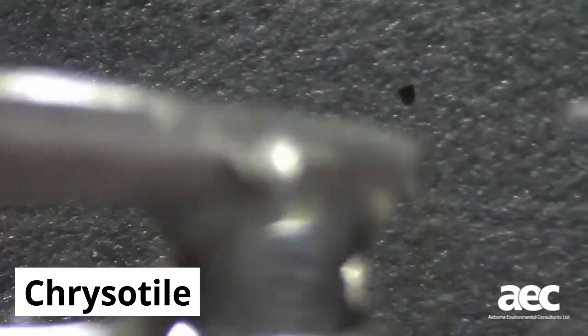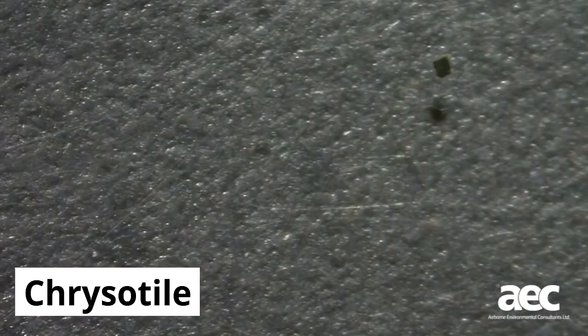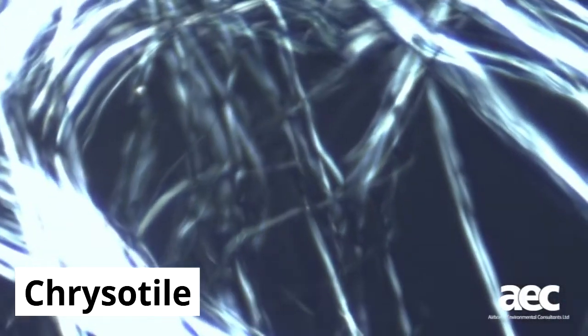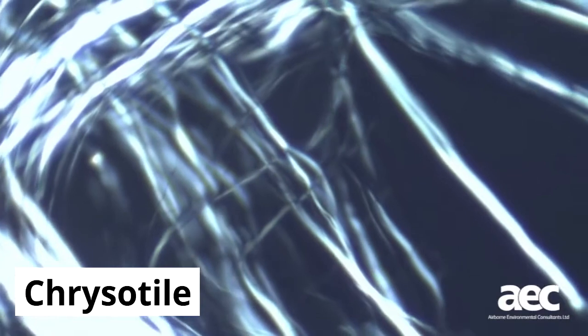As with amosite, chrysotile shows little colour change under plain polarised light and also shows little to no relief. This means that the fibres seem almost invisible at this stage. Next is the birefringence and extinction. The fibres again appear and disappear, indicating a mineral, but the fibres don't glow quite as brightly as the amosite fibres did.